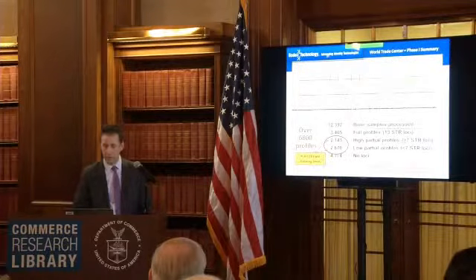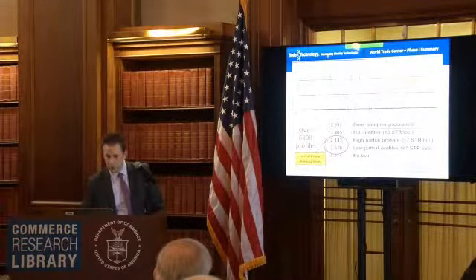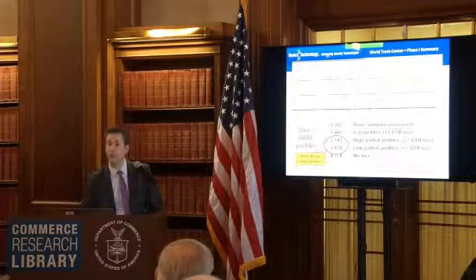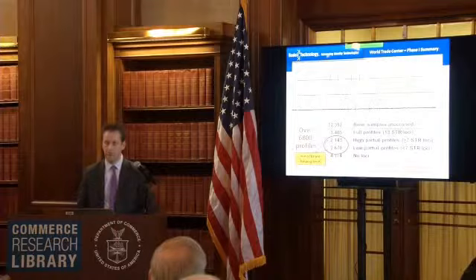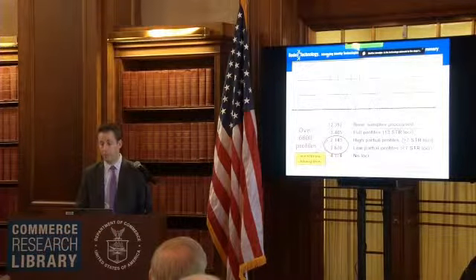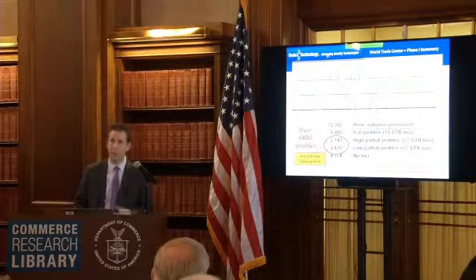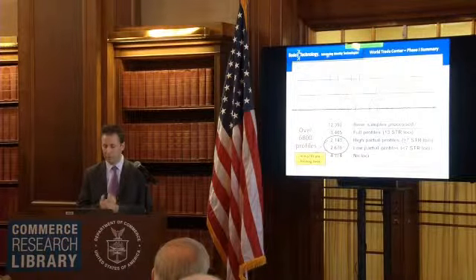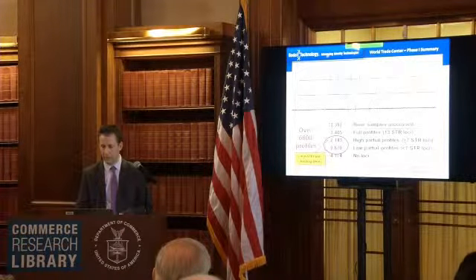But this is the case where mini STR assays will help. The mini STR assays would really show up in this area below 160 or so. So essentially, what all these are is a smaller PCR product size that works better with highly degraded samples. And then this has been converted over to a kit called Minifiler that Life Technologies makes specifically for degraded samples. But this is an idea of how NIST played a role in the development of technology for typing degraded samples.